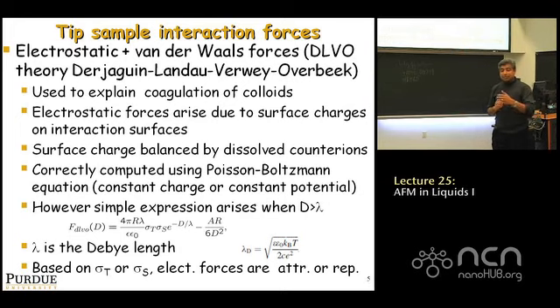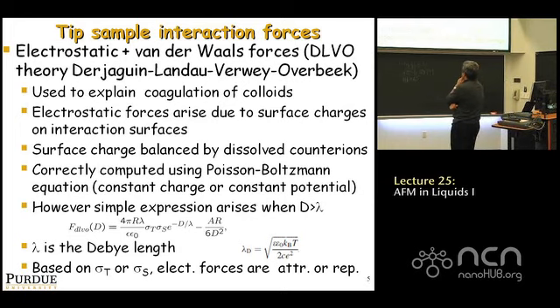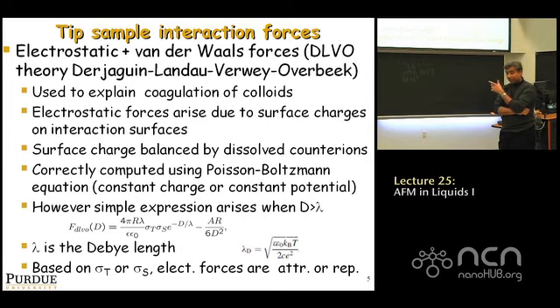Quick question: is A in the second term there the same as the Hamaker constant, or is it the corresponding Hamaker constant for the samples? Yeah, it's a Hamaker constant. The mechanism is exactly the same as what you have studied before. Again, if you go into the theory of Hamaker constants in liquids, Israelachvili has a very good discussion of how to do this calculation in liquids and so on.